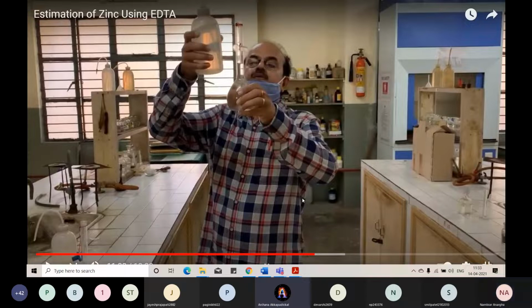This particular volumetric flask, आप वो जो neck देख रहे हो, it is having certain mark on it. वहां तक आपको dilute करना होता है. And you have to be very careful in it. You must have observed how he is taking time and diluting the entire solution, because if you add even a little extra of water above the mark, the concentration will change and the entire reading will go wrong, because this is the first step.